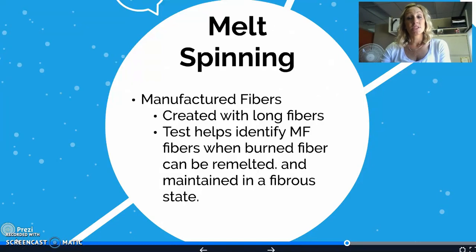But again, just as the burn tests have their limitations with blended fabrics, multiple fibers within the same fabric, or any finishes that are done, you may have inaccurate results. So be prepared for that. That's why we're doing 4 completely different tests, to combat all of the limitations that each test or each experiment presents to us. Our next 2 experiments, we're going to get away from the flames, and we're going to do some other things with them.